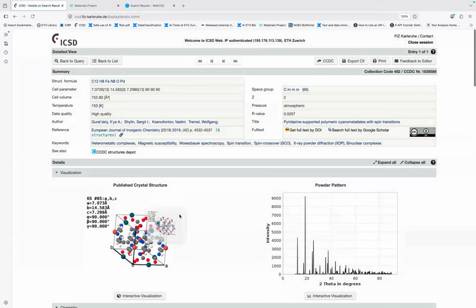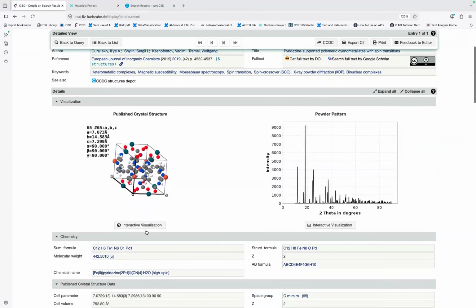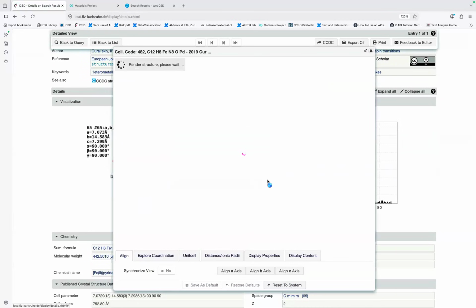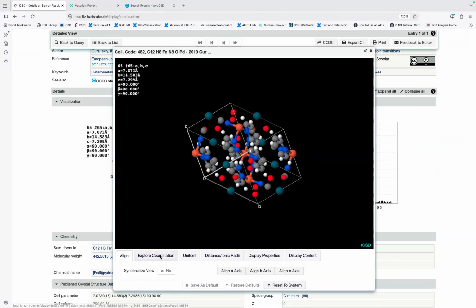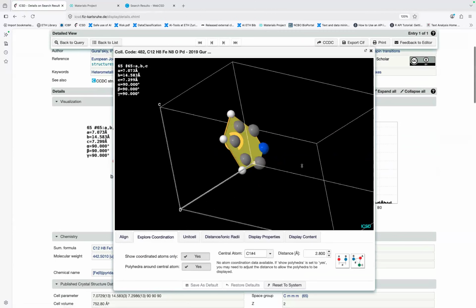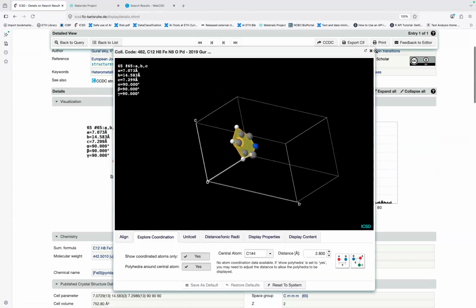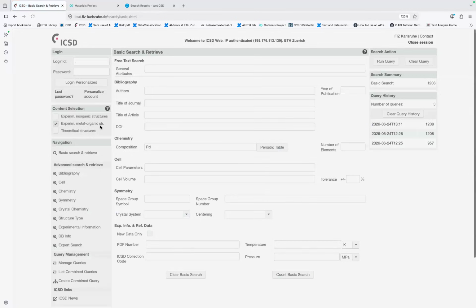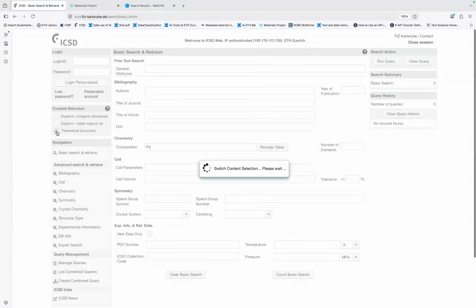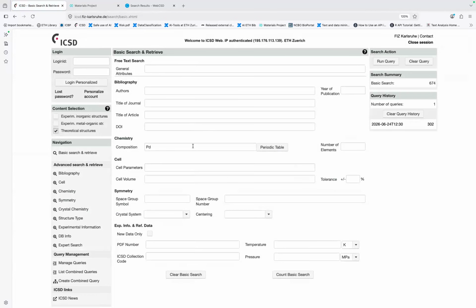And these are then also, like before, one can look into them. They get more complicated. And I think this is really very helpful to look into details of what's going on here. Good. Similar is then for the computational structure. So I will not go here. You can check yourself. You do the same thing.